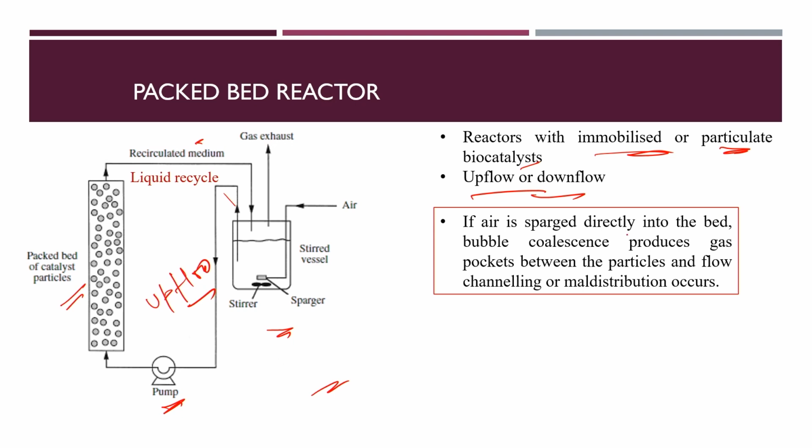If air is sparged directly into the bed, then there are chances of bubble aggregation, which produces gas pockets between the particles, and this causes flow channeling or maldistribution of the media.